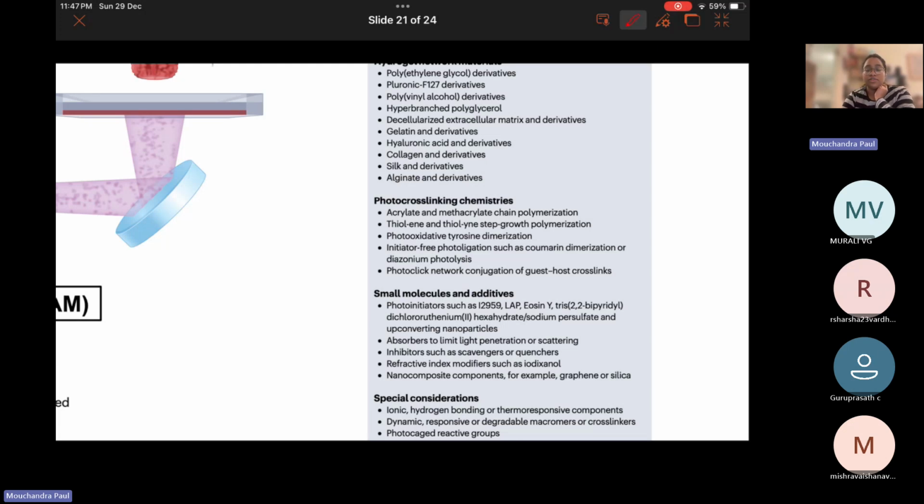So what are photoabsorbers? They basically absorb the excess light that can penetrate within the hydrogel. So cells, they are transparent in nature and they can scatter light. So all of these scattered secondary light beams that can travel within the vat can basically cause unwanted cross-linking and then distort your 3D structure overall. So in order to limit or prevent that, these photoabsorbers basically absorb the excess light.